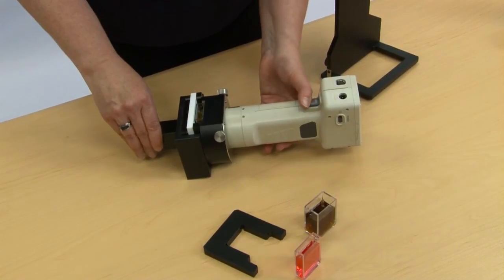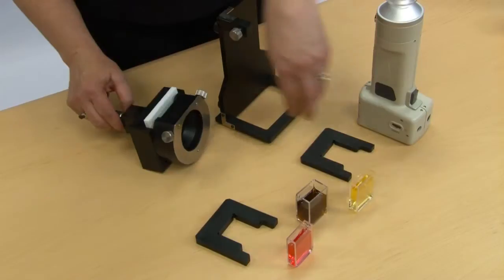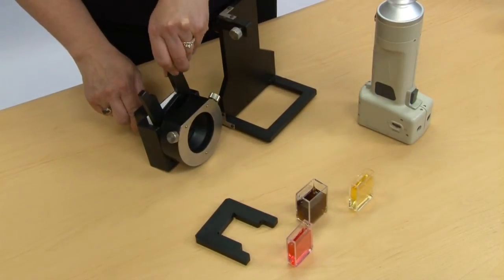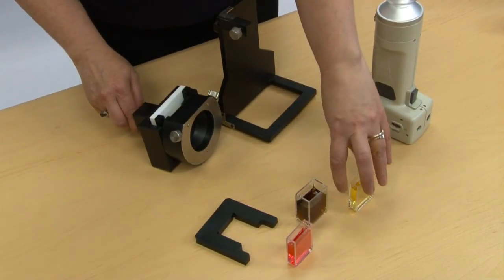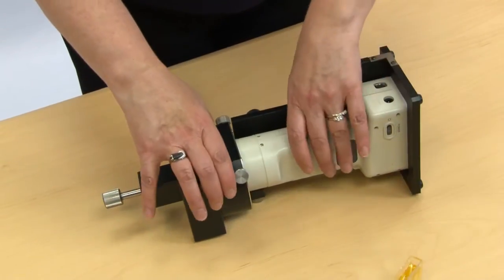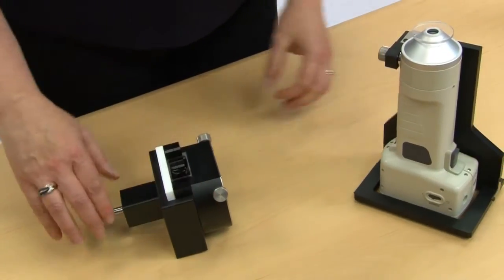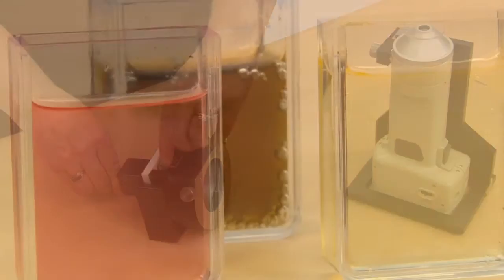With the 20mm cuvette, two spacers are required. For a 10mm cuvette, only one spacer is required. The holder comes with both spacers and a white backing plate. The CR400 cell holder is compatible with the CR400 410 stand, as shown here. Cuvettes are sold separately.